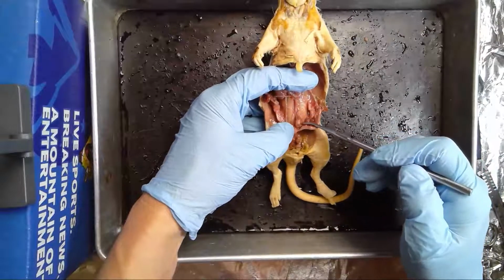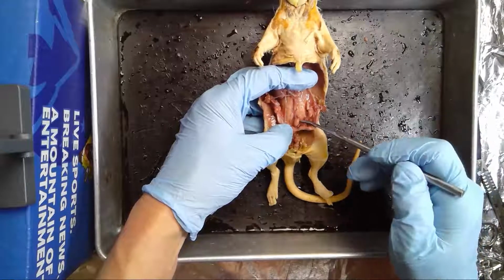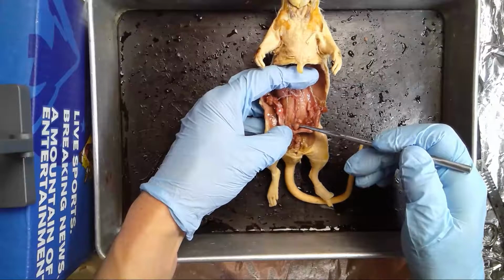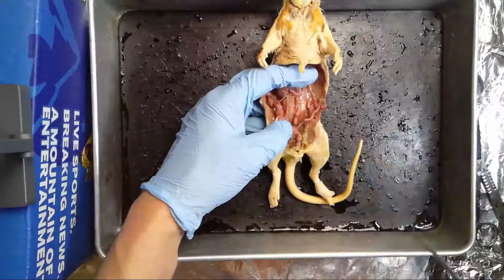Now there's something I should point out in the middle here. This is the colon, or large intestine. So that's the structure, and I've cut it off, so it's kind of short here. Don't confuse that with anything else. It's not involved in reproduction.